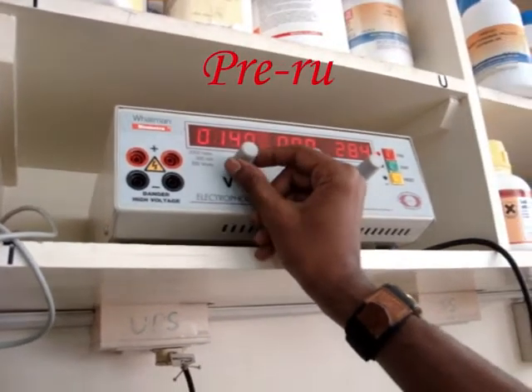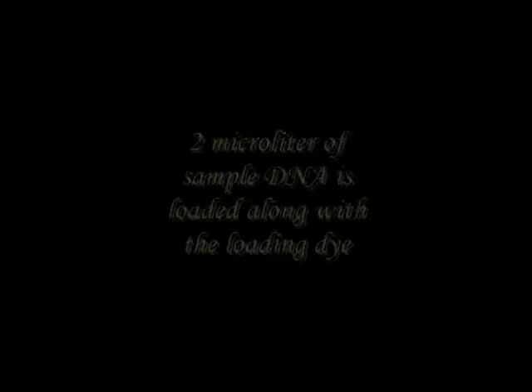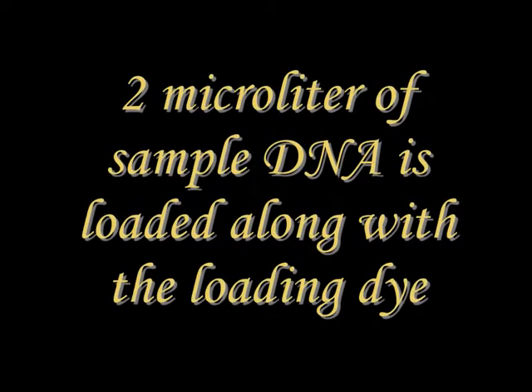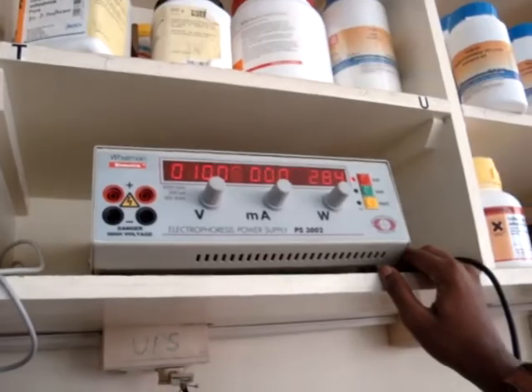First, give a pre-run before loading for 30 minutes at 100 volts. Then, 2 µL of sample DNA is loaded into the wells along with the loading dye. After loading, run the sample. During the running process, two bands appear: the first band is due to xylene cyanol, which carries high molecular weight molecules, and the second band is due to bromophenol blue, which carries low molecular weight molecules. The running process is carried out for 30 to 45 minutes, followed by silver staining.